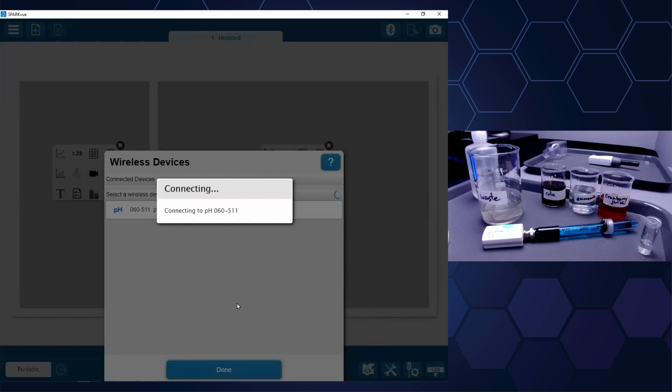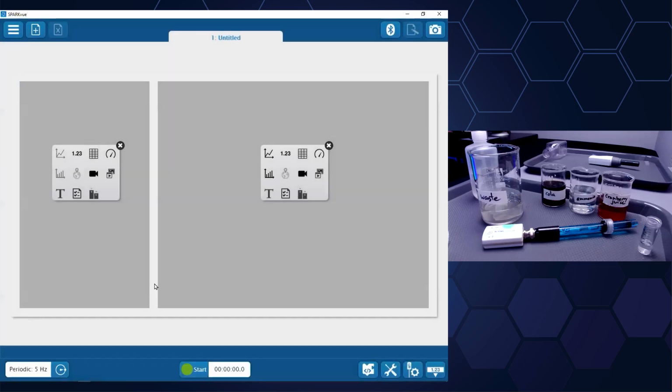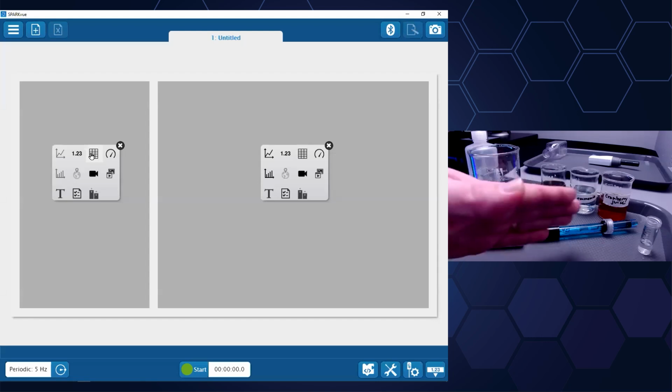Now, there's some good questions about calibration here. Again, I calibrated earlier because I don't have a lot of time, but I'm going to go in here and choose a table along the left. Some of you, Kate in the chat there said I'd use a table. Yeah, I think a table is particularly useful because we know we're going to collect just a limited number of pH points, or at least we need only a limited number of pH points.